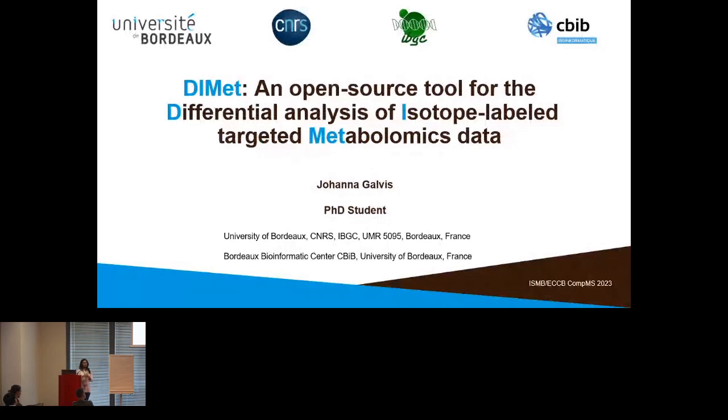First, with our DIMet tool, we were able not only to visualize, but also to statistically analyze the abundances that I am showing here in the first part of the analysis for the double KO versus control samples. We analyzed all the metabolites, but I am only going to show here the most relevant findings in the context not only of the statistics, but also the network.